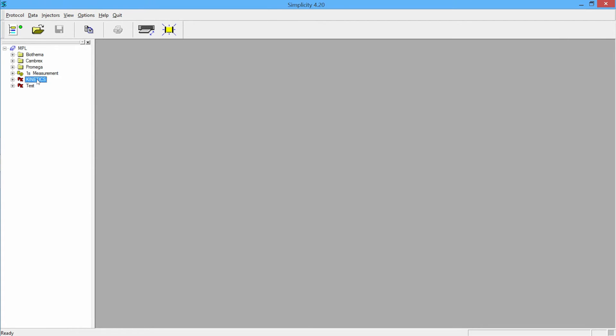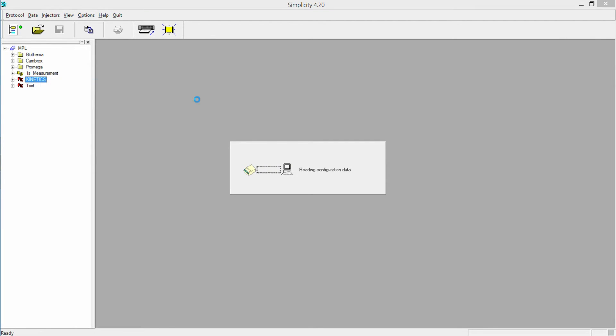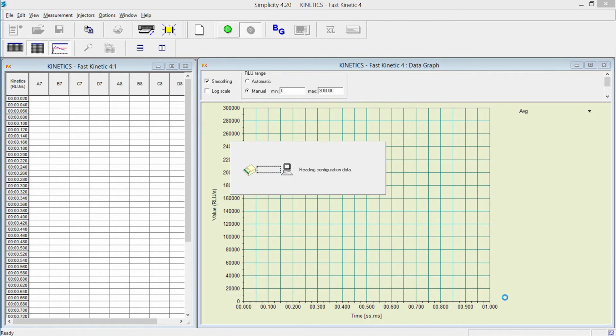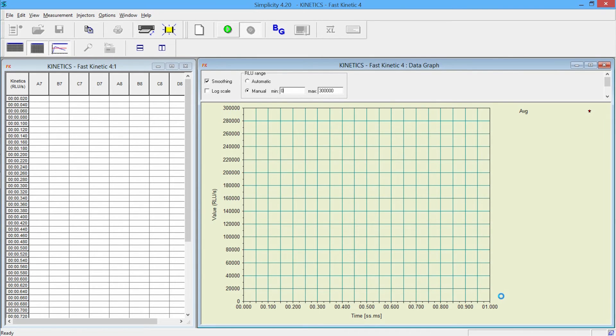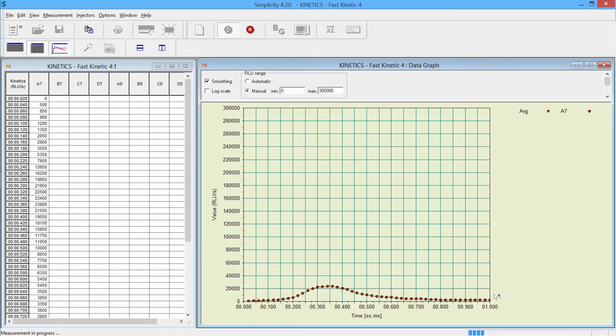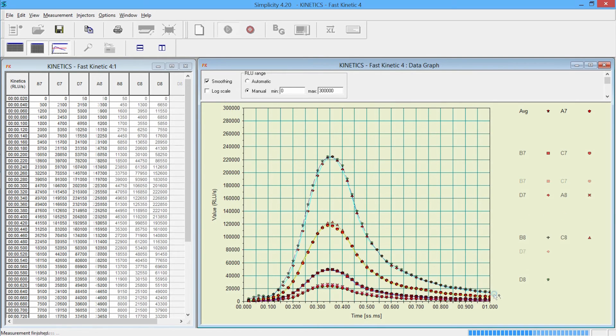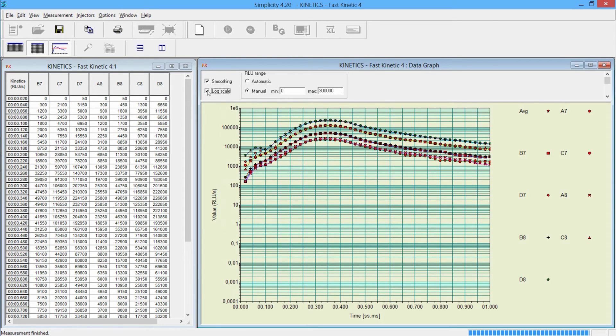Kinetic measurement can be selected with time resolution as fast as two milliseconds. The graphical representation of the results allows you to easily follow the reaction in each well. For best visualization, both linear and logarithmic scales can be selected.